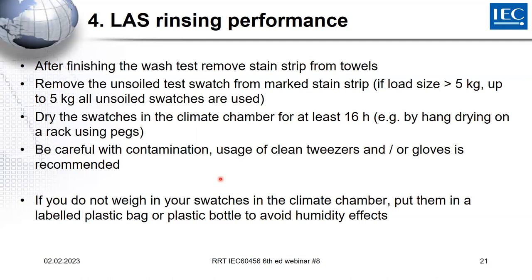In some labs, you might not see any difference because the conditions in the climate chamber are more or less similar to where you measure it. But you have to think we have a global standard, and there are areas in the world with higher temperatures and higher humidity, or higher temperatures and lower humidity, and you might see some effects. That's why it's recommended to put them in plastic bags or in a bottle, and then to keep the humidity at roughly the level that we had in the climate chamber.